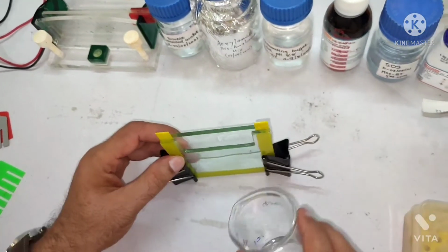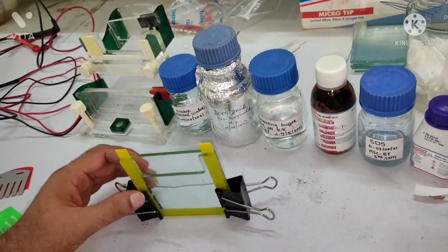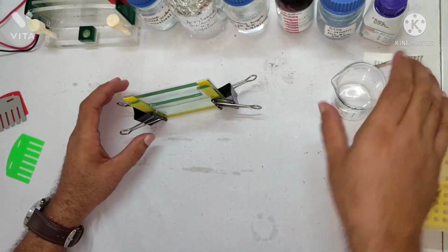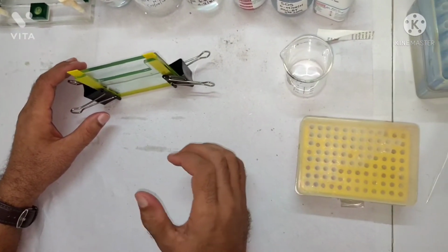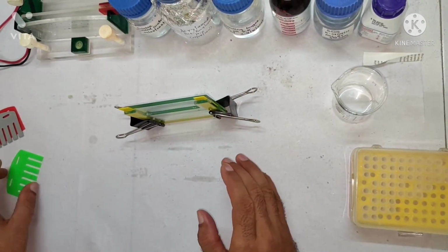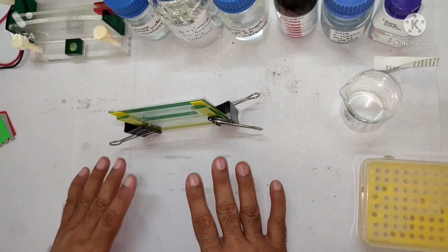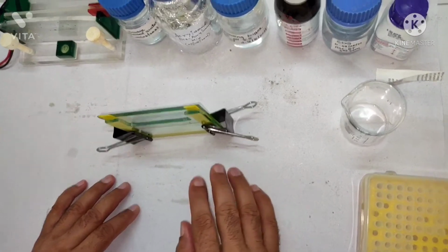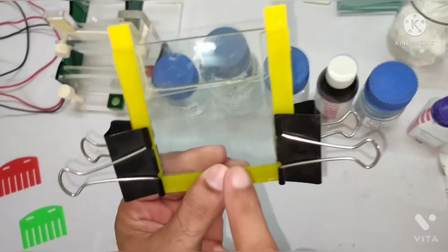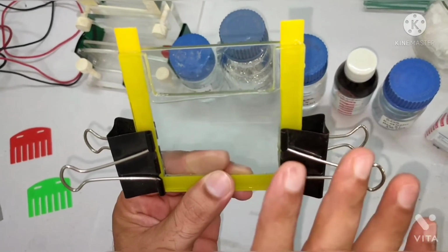Okay, so we add it. Always take care that bubbles should not come, right? Okay, all right. So this is the separating gel, and if needed you can add a water layer or a butanol layer over that. Otherwise, it is not a necessary chemical to add. All right, and then after 15-20 minutes we make the stacking gel, right? You can see we added water over the separating gel, so you can see a very thin line, and this indicates the polymerization.